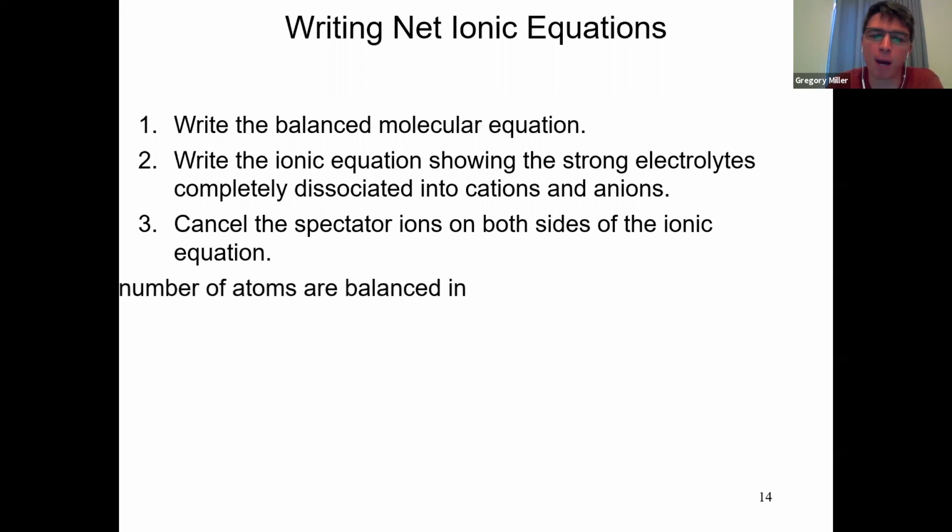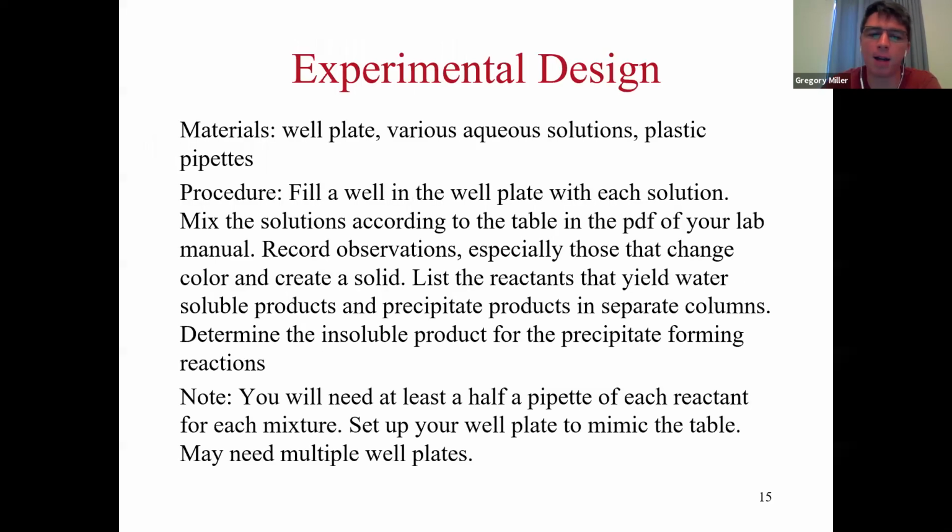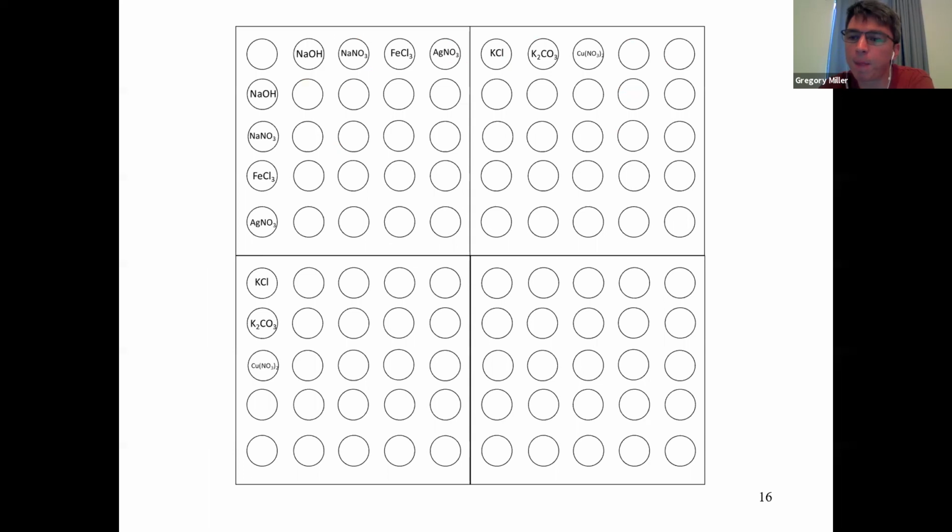And again, you can go back and look at the previous example, or if you have questions, reach out to me. You'll be doing a lot of this with the post-lab questions, so that'll really help you get through being able to predict these products and making ionic equations. The experiment itself is very, very easy. Like week one, we're mixing a whole bunch of stuff together. So what we're going to do is mix all of the different reagents together and write down what we see. And you'll see all of that in the experimental video.